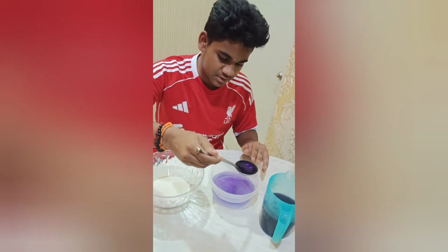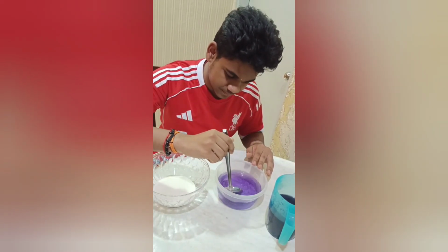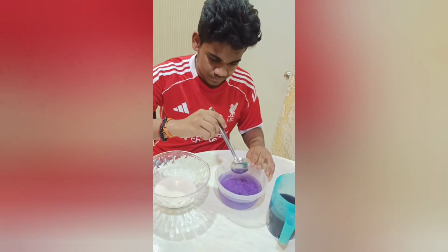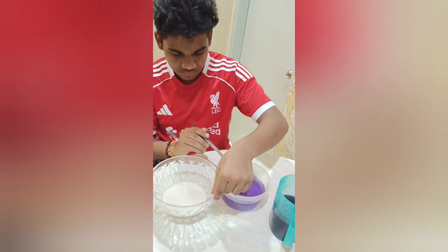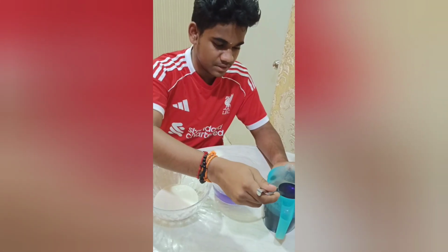Once you pour the red cabbage solution into the fish tank water, stir it. And now, you pour the red cabbage solution into the milk.